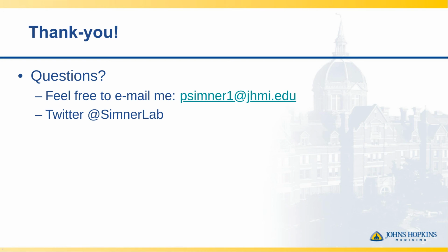And so that's one thing that we're planning to work on as our next study. And to tie together some of the other questions, we're going to work on using the Flongle, try doing this more in real time along with clinical care, to assess how well we are doing in terms of workflow in the lab, as well as how well we are doing in terms of cost comparison from an FTE standpoint and reagent standpoint as well. Great. So that's where we're going with that.